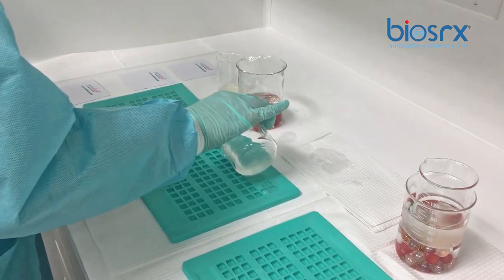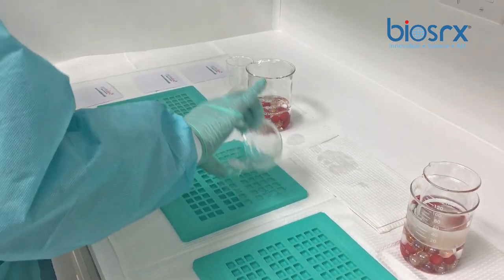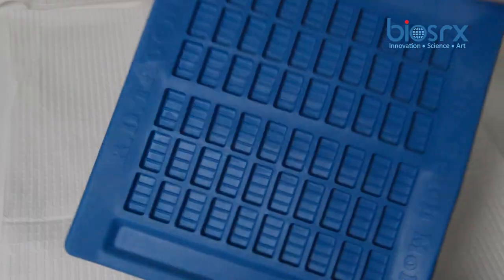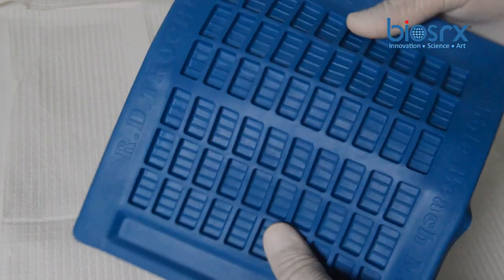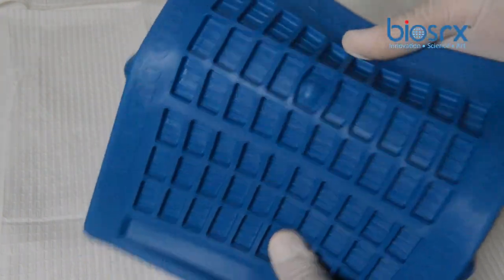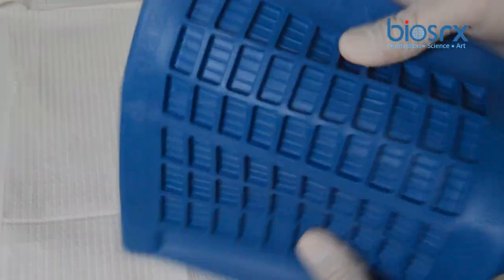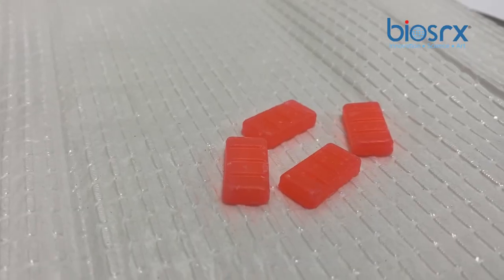I can pour the preparation over the mold and spread it across the cavities I need. The rubber-like properties allow for greater flexibility and easier release of trochees out of the molds. This prevents trochees from breaking or becoming damaged during removal.